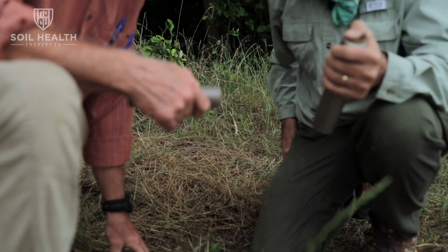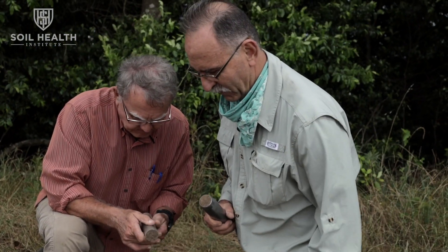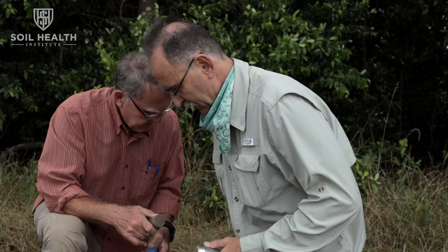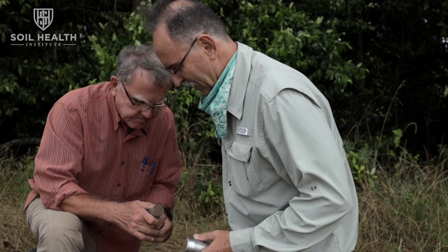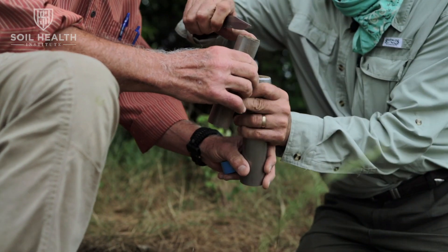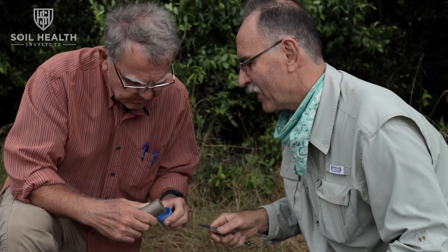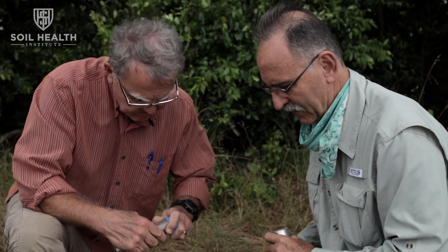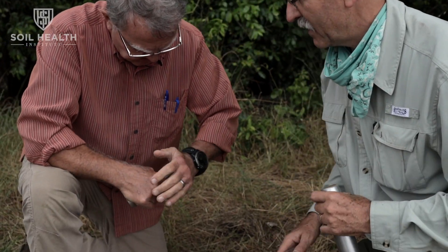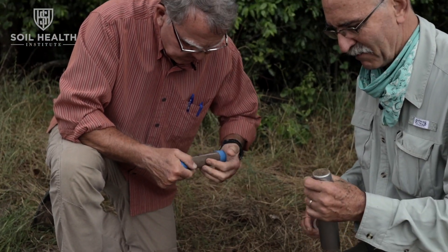If you want it to be really precise, you can level it off with your pocket knife. So just level that off. I'm a bucket chemist so I'm not that precise. You can put the end cap on, then we'll do the woods sample. You can also mark top and bottom if you want to.